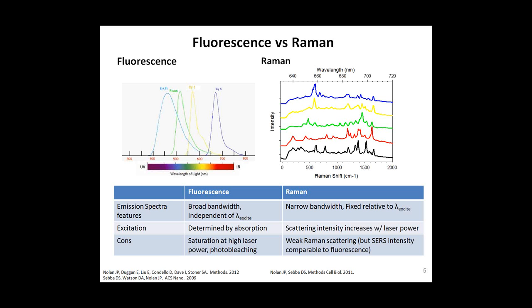The way fluorescence imaging and Raman imaging are implemented is relatively different. For Raman, we only need very simple instruments. On the other hand, for fluorescence imaging, we need different filter cubes to select, and we need a bunch of cameras to capture. So Raman definitely has some advantages over fluorescence. If you want to see more about the Raman tags that we developed in the lab, there are a bunch of references listed here.